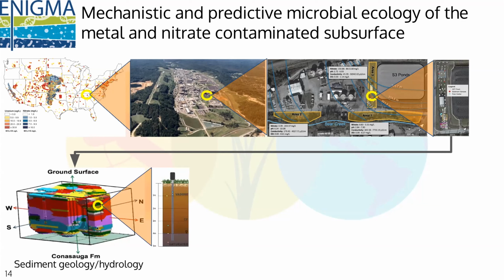Now, when you look at one of these wells here, this is all space indexed. So we know exactly how tall the well is. It will be screened at some level here. I mean, there's water flowing in through some region of this. And that is a measurement of what we think the water is flowing in through this region, and should be a measure of what microbes and other chemicals are present in that region. We've also scored the surrounding regions by the type of region it is, for example, vadose, capillary fringe, or saturated region.